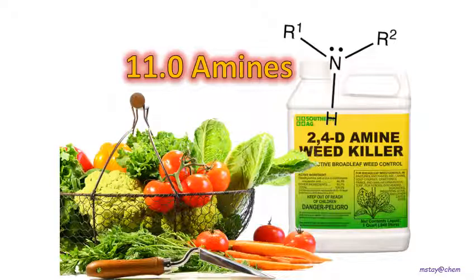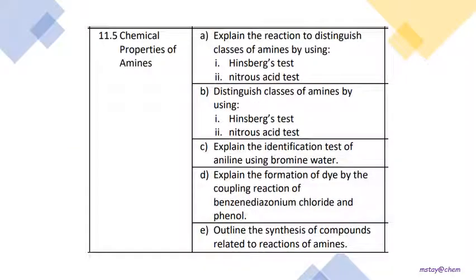We are still in the chapter on amines. We already went through the Hinsberg test and also the identification test for the aniline. So in this video, we will focus on the nitrous acid test and also the formation of dye through the coupling reaction.